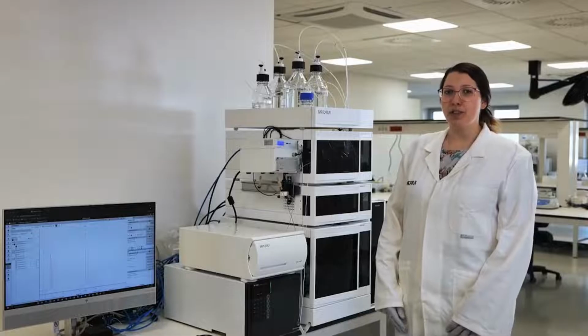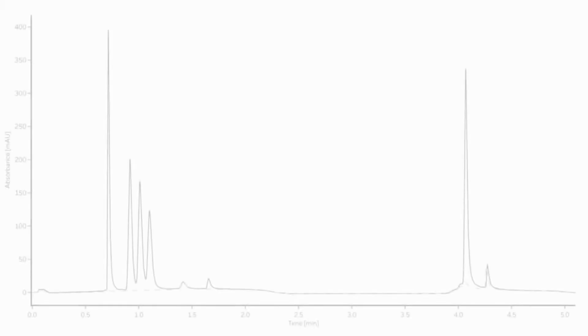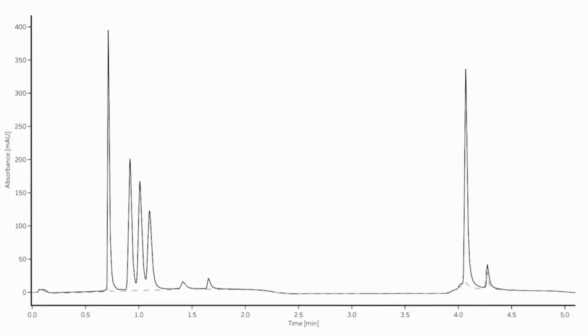The method we developed and validated has a 4.5-minute readout and is based on the separation of nucleotides in an ascending salt gradient and the elution of mRNA under high conductivity and pH conditions. With our method, we are able to separate capping reagent, nucleotides, DNA linear template, and of course different modalities of RNA.